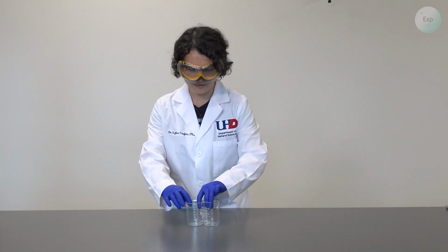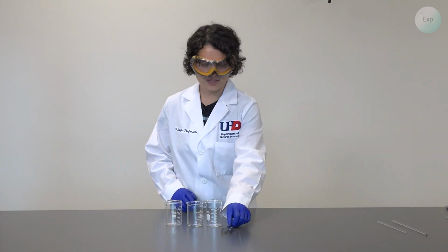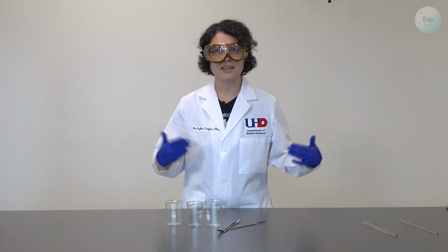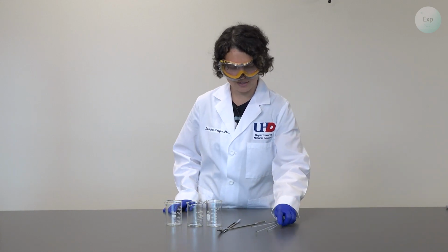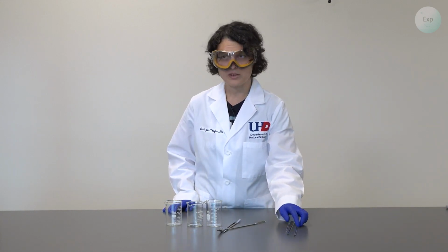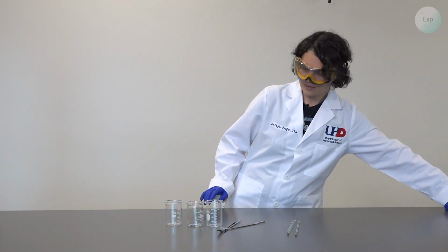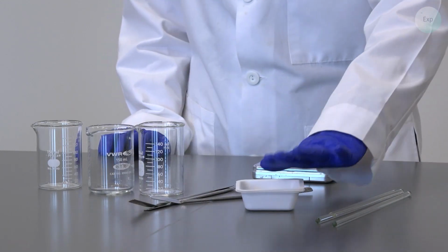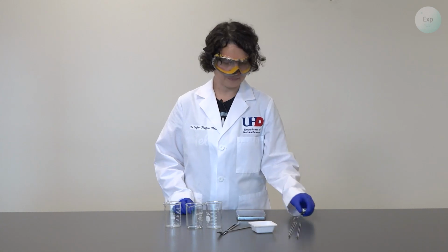I will be using 3 150 milliliter beakers. I will use 3 spatulas, but you may use just one and clean and dry in between measurements. I will also use 3 stirring rods. You may use just one and clean and dry in between experiments. We'll need a scale, 3 weighing boats, and this is optional, you may use a laser pointer.